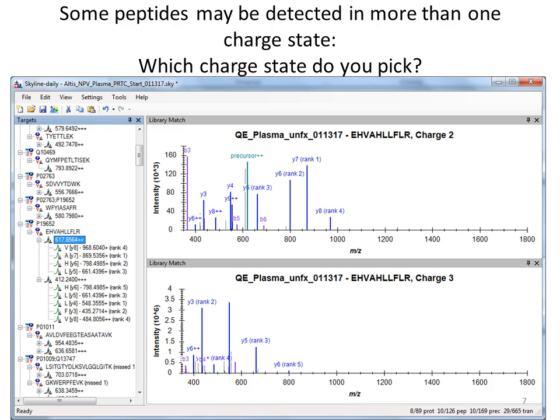And then anything that has a spectral library associated with it has this little stick figure thing next to it. And Brendan can explain better what all these little icons are, but one is a protein, another is a peptide, and that's a peak. So if you look closely, it's kind of intuitive.